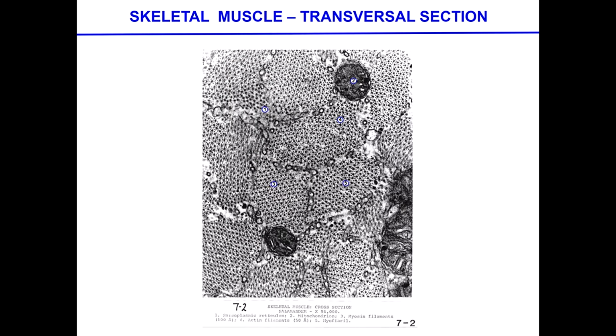All right. So these are now transversal sections at different levels in the structure of the sarcomere. As you can see here, we're looking at a portion of the sarcomere where the thick and the thin filaments are located. We can see the thick filaments, and if you have the patience to count, you can see that for every single dark dot in there, there should be 6 of the thin ones around it. That's the perfect view of the structure.